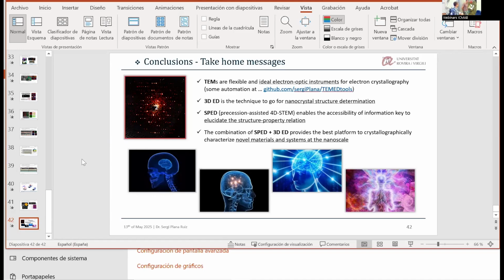No, what is the DPC? DPC is just taking the differential phase contrast. So earlier works were done like this. If you do 4D STEM with the objective lens off, you could do that. But the resolution that you may have may not be that huge.